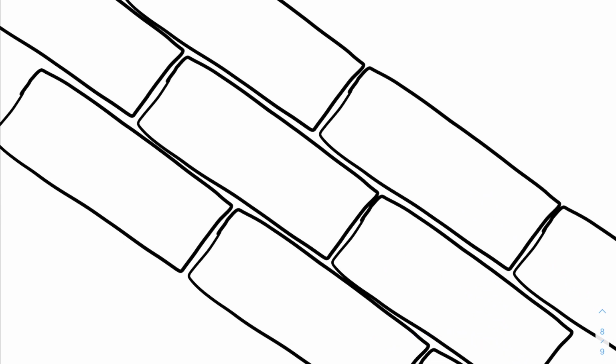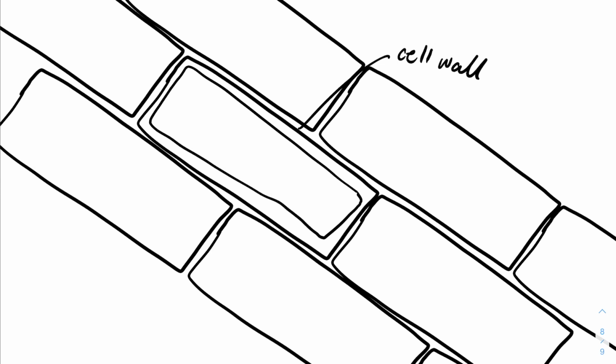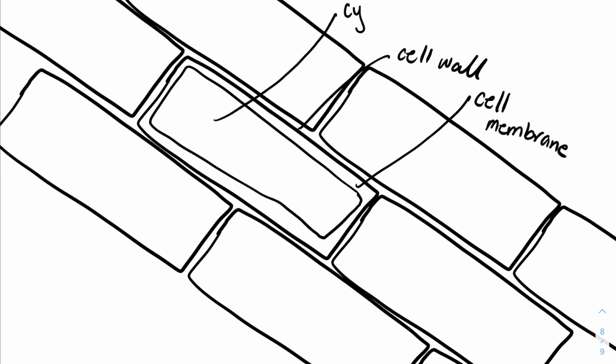So we can see our cell wall, which is our thick border here. And within our cell wall, we can faintly see some resemblance of a cell membrane. And at this magnification, that's pretty much all that we can see. We can see the interior of our onion cell as well, which is our cytoplasm. So even though we know that there will be the presence of other membrane-bound organelles, under this microscope we can't see them, so we're not going to draw them out on our diagram.